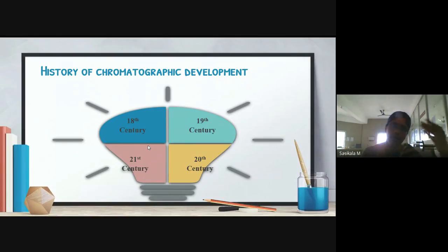And what is the development? Recent development in chromatographic technique means coupling of different chromatographic and spectroscopic methods, like coupling IR and mass, coupling NMR and mass spectrometers. For more accurate and sensitive detection, and to get more information about molecular structure, the techniques have been developed with both chromatography and spectroscopy coupled to give wide information and applications over whatever analysis we carry out.